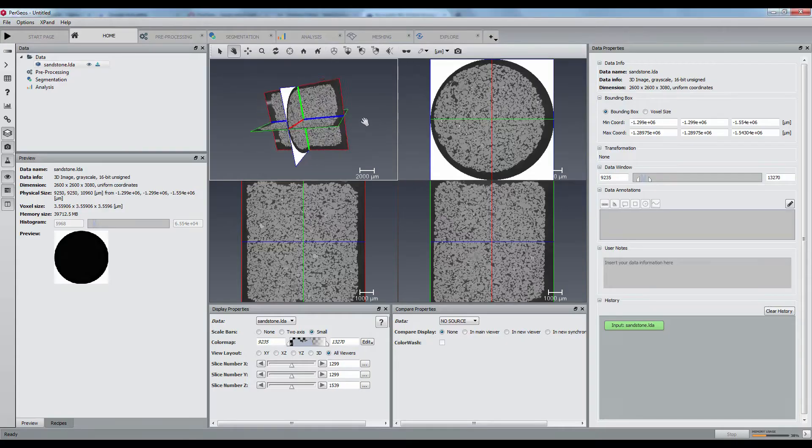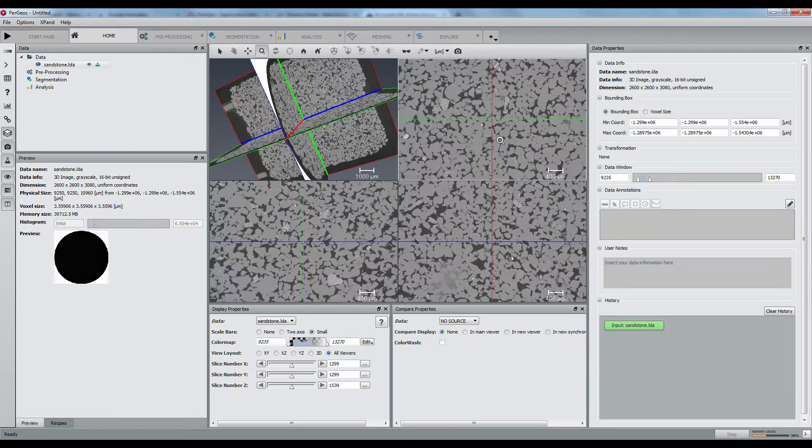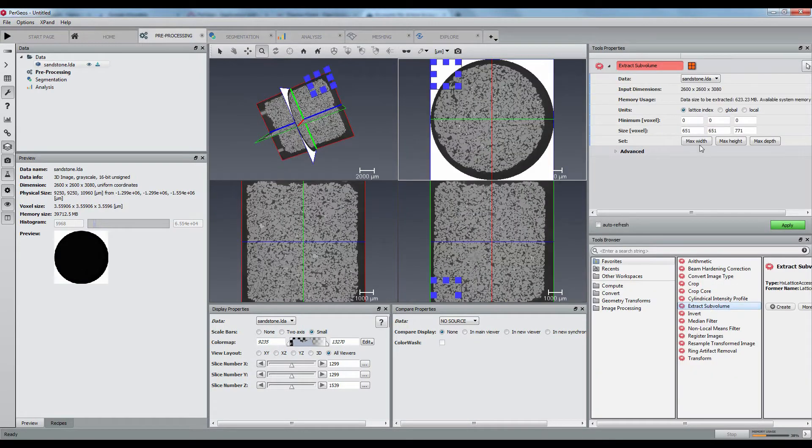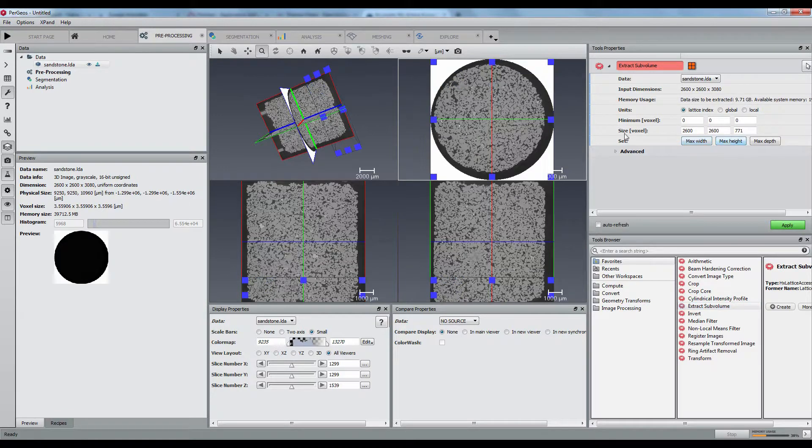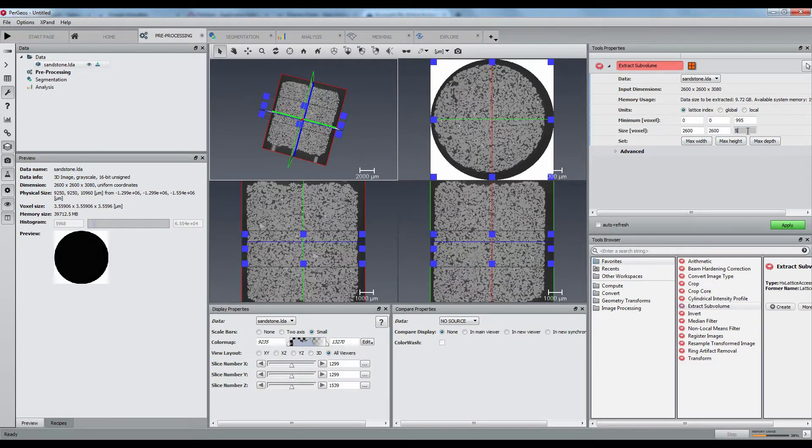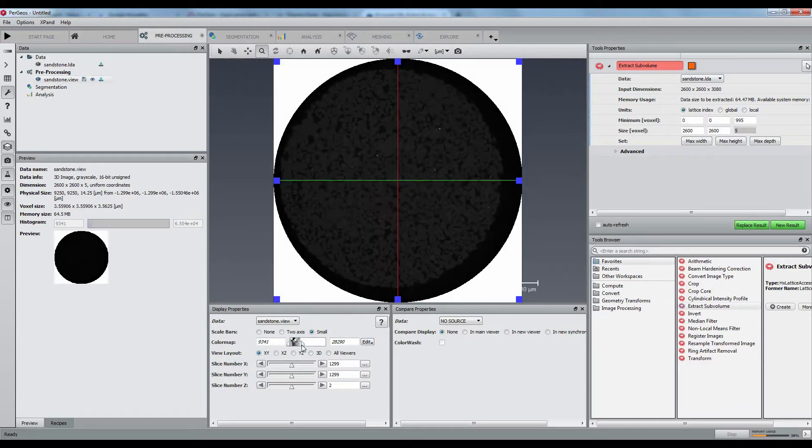I will explain here how Pergeos can segment and separate the grains of a 40 GB dataset using only a small amount of memory. Let's first create a recipe based on a few slices of the volume.